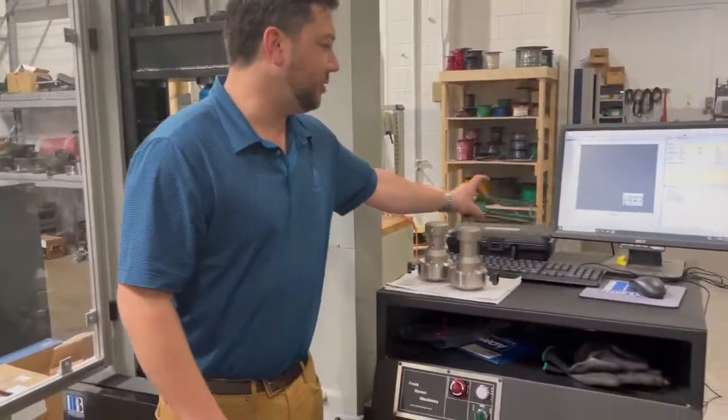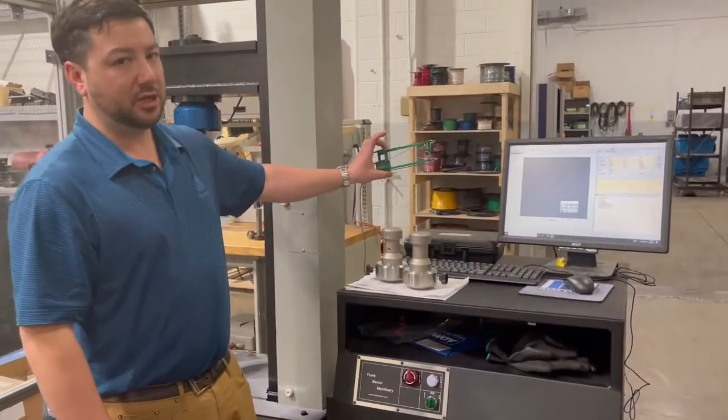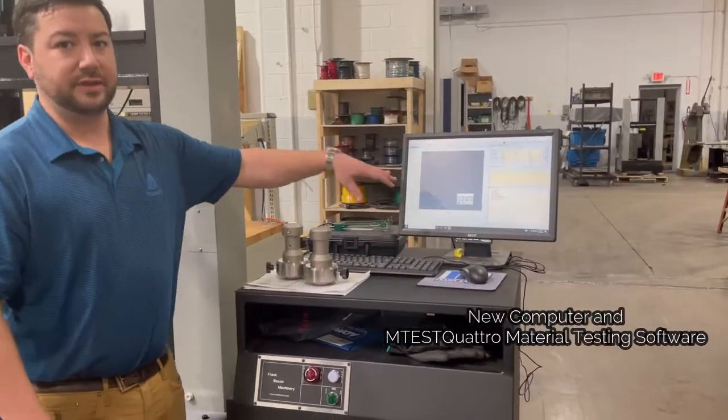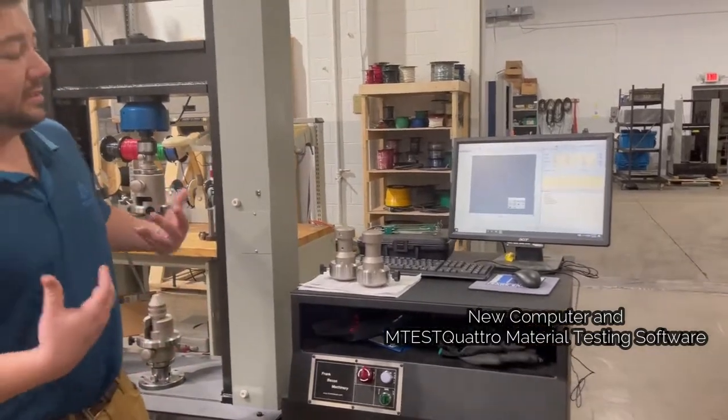We've also got our extensometer here to give us yield and elongation, and then our Quattro controls to give us all of our reporting and test control setup.